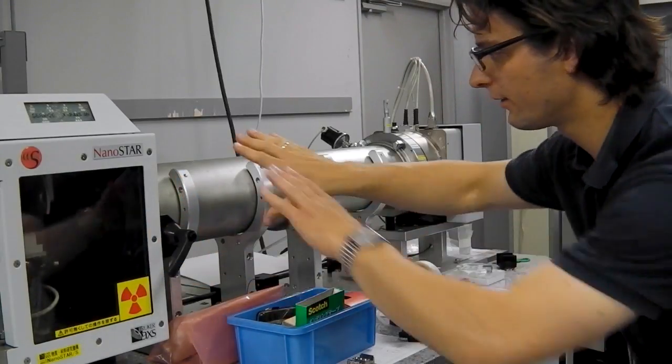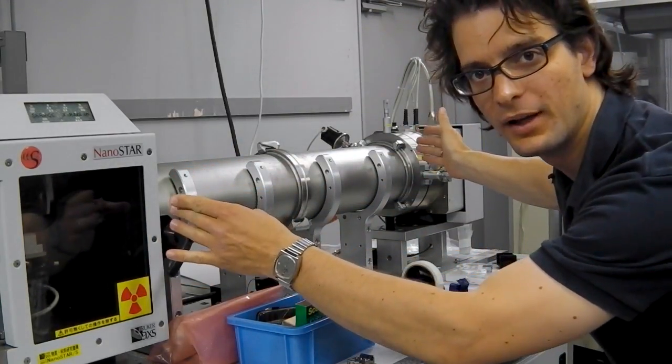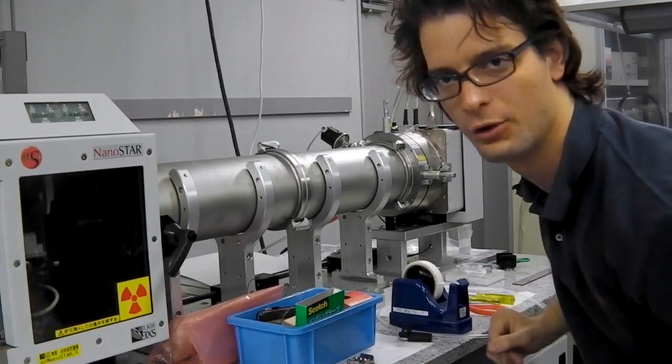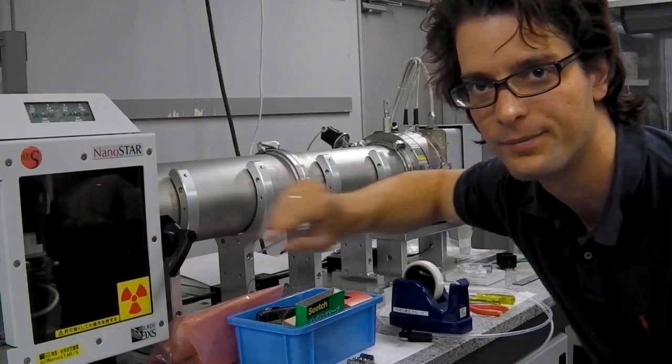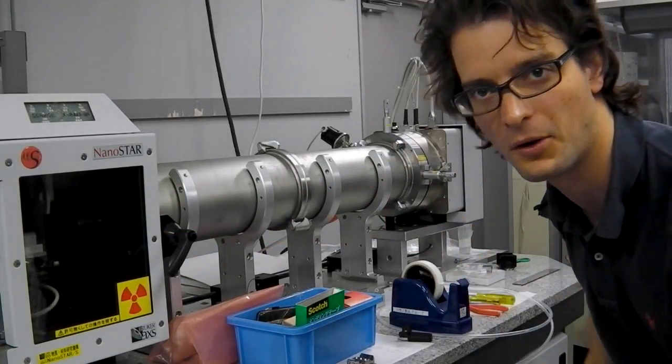Now after the sample, we have a flight tube. This flight tube is nothing more than an empty vacuum tube to create some distance between the detector and our sample. So this way we can measure to small angles.